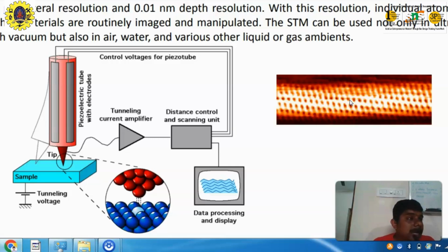These nanometer sizes are studied by passing the piezoelectric tubes. It improves the sensitivity of detection, and based upon the detection it conveys the information to the screen. That is why we are using the STM as another method of microscopy which can be used to determine at the nanometer level.